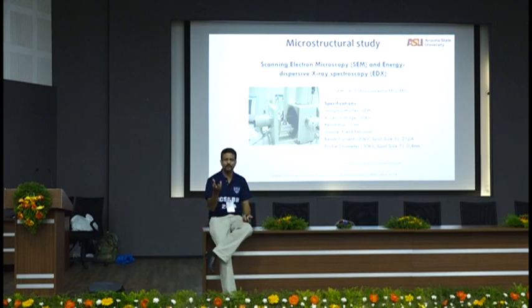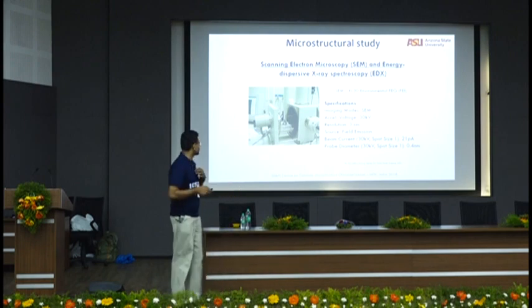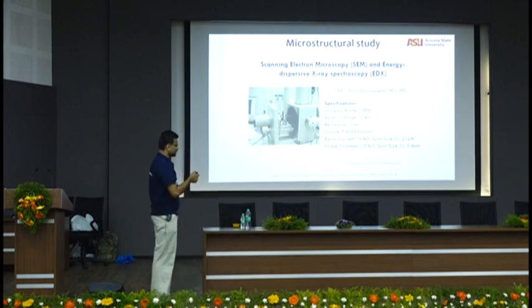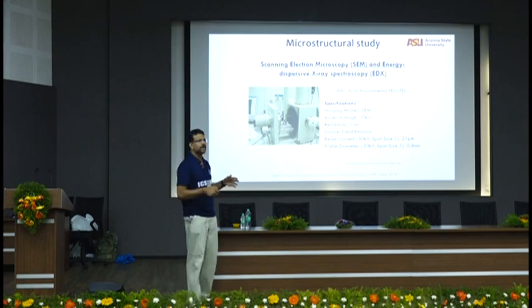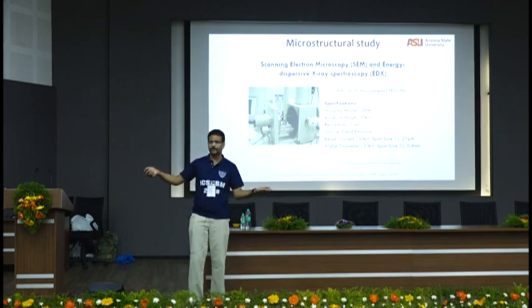But if you have some water in your sample, environmental SEM is the best thing. If you want to have backscattered, then you have to have a very good surface coat. Even for secondary, you want to have a surface coat so that charging problems are avoided. Then there are issues with beam current, the voltage of the current, the spot size, the probe diameter, the resolution, accelerating voltage, all of that. Many of these SEMs go from accelerating voltage of 5 kilovolts to 30 or 40 kilovolts.